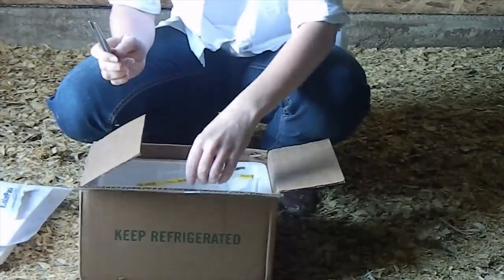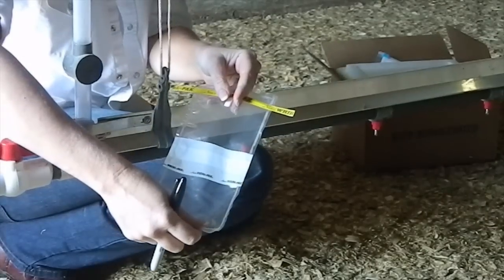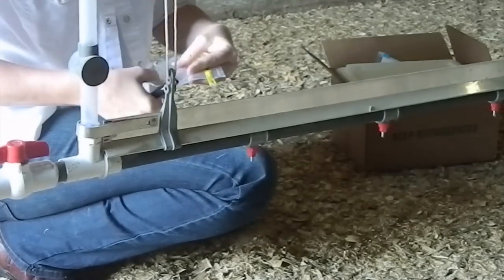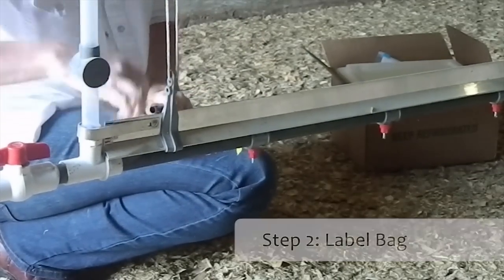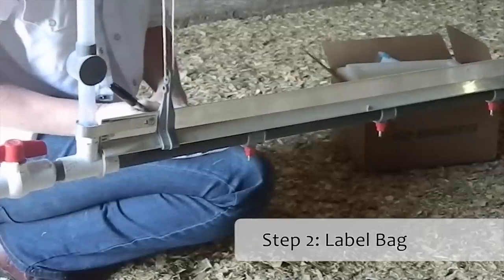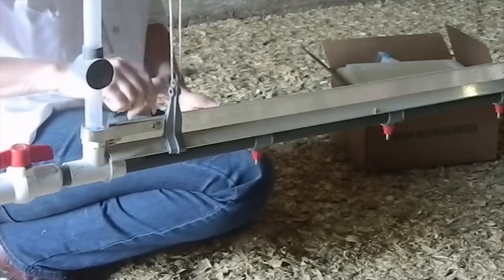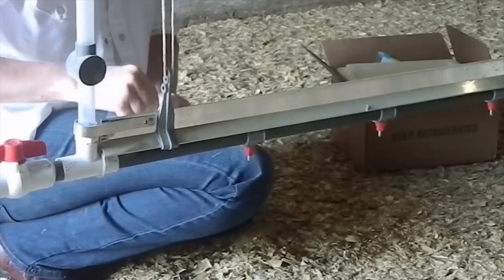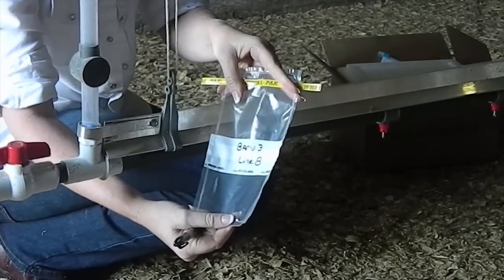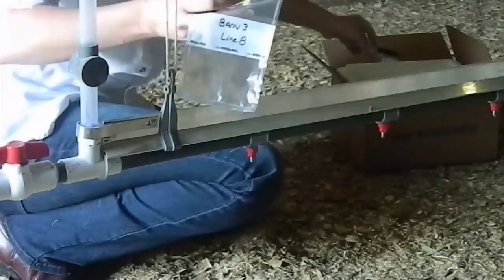We will start with the drip sample. You have in your kit several of these foil pack bags. I would suggest marking on them before you get water dripped anywhere, with whatever sample number will help you identify the location that you have taken this sample. That way, when you get the results back, you'll be able to identify the location.